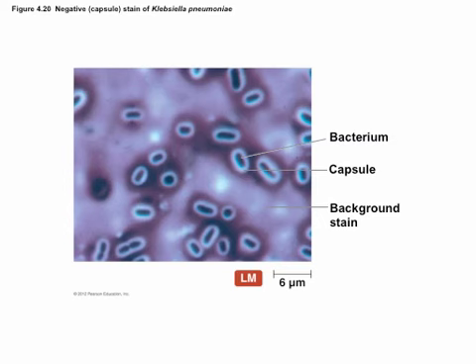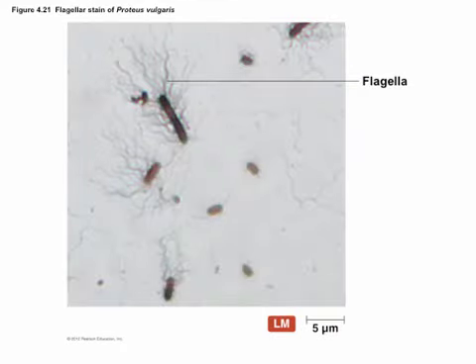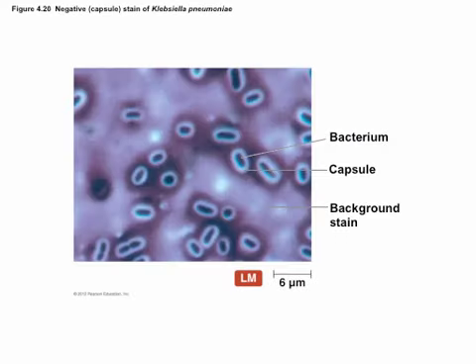How does the dye get into the capsule, into the inside of it? The dye actually can move through the capsule just fine. It just doesn't stick to it. See, the cell is charged, so it sticks to the cell. The glass, believe it or not, is somewhat charged. It's silicon dioxide, and the oxygen in glass is a very easy thing for a lot of dyes to stick to, and so it'll stick to the glass just fine. But it'll move through the capsule, but it doesn't stick to it very well. It just doesn't get stuck in it. It would rather be anywhere else. Does that make sense?